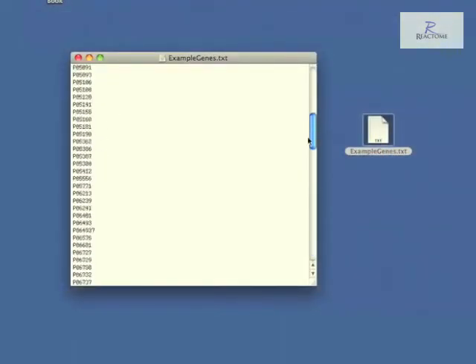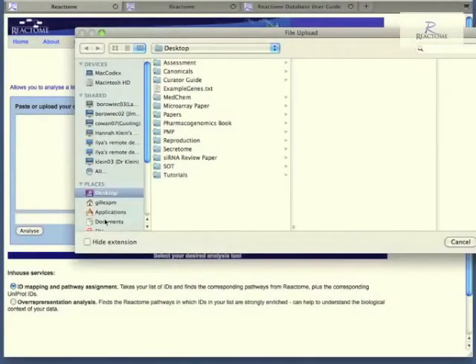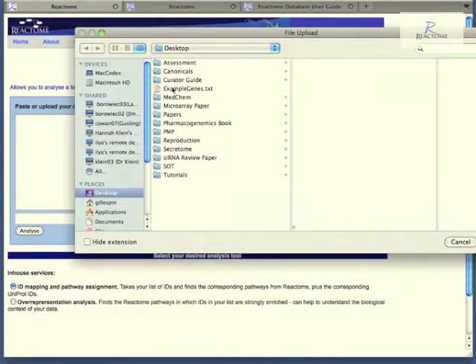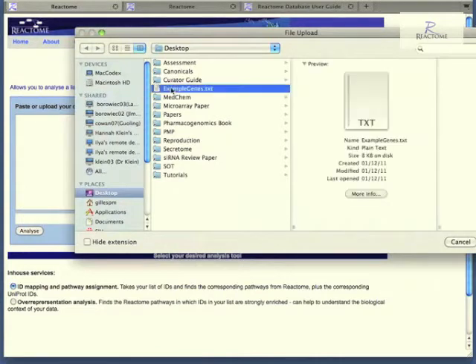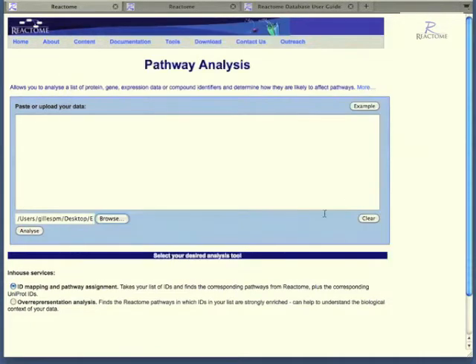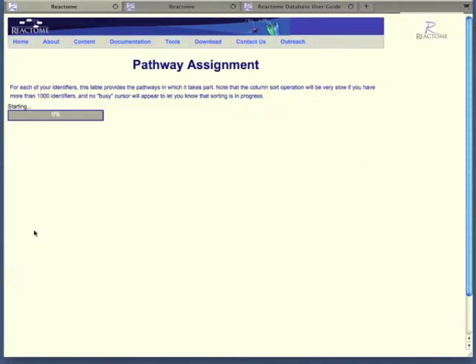In this case, I have taken the example data and created a local file. If I select that local file, in this case example genes, I can then return to the window and upload that file and start the analysis by clicking analyze.